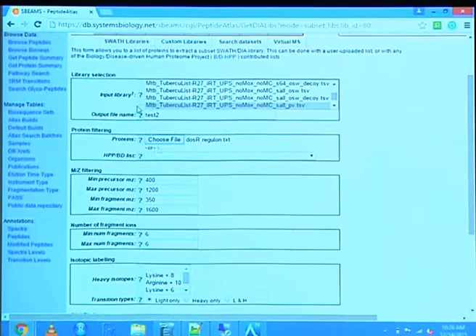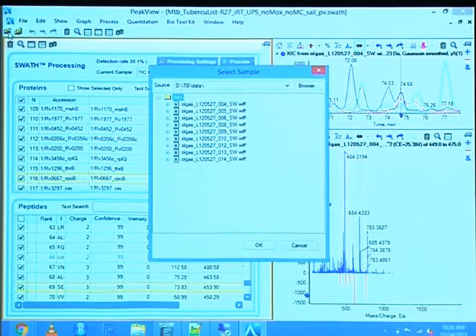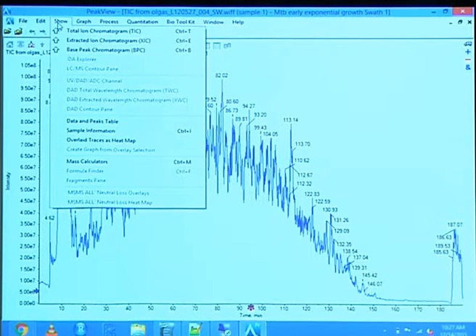In the case of the M/Z filtering, that might be an issue if you get the raw file from someone else and you don't exactly know what the settings were. At least for WIFF files, or SCIEX acquired data, you can just open one and press Control-I, or Show Sample Information.